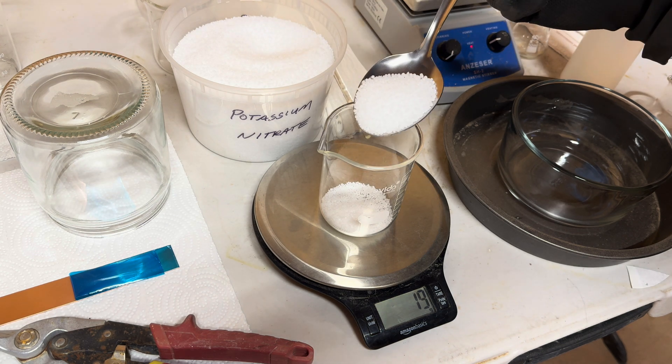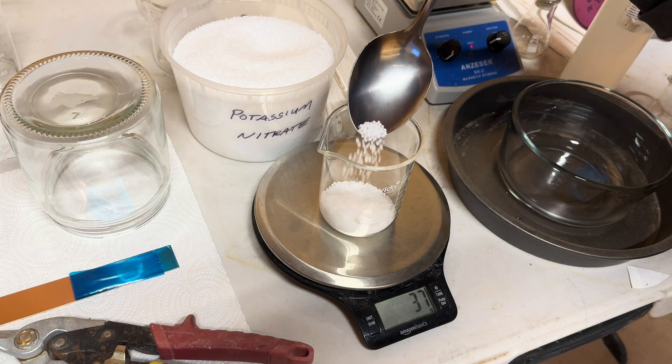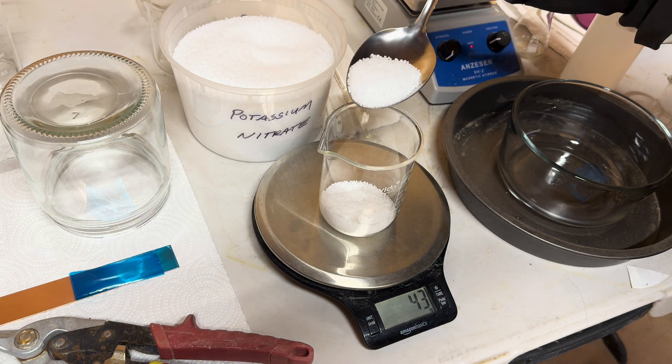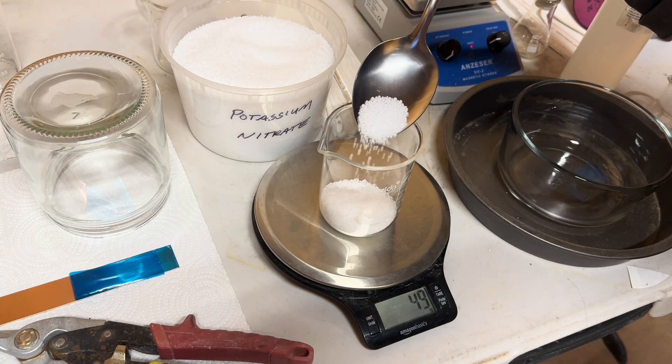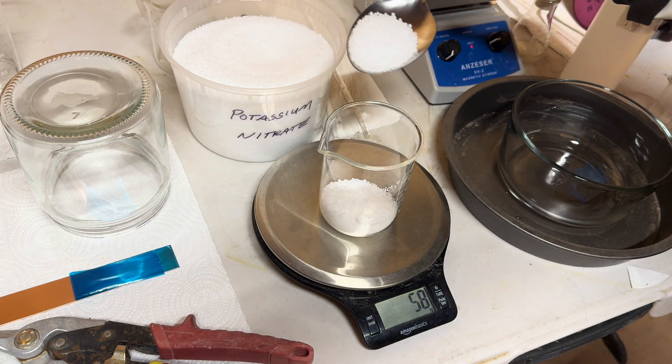Today we are going to make a weak version of nitric acid. First, let's add 80 grams of a nitrate salt. Today we are using potassium nitrate. You can use sodium nitrate and you can also use ammonium nitrate.